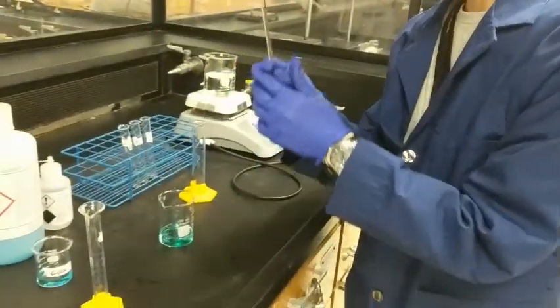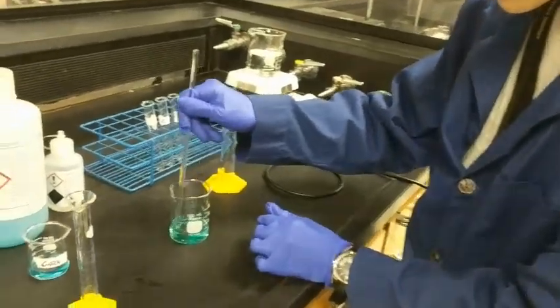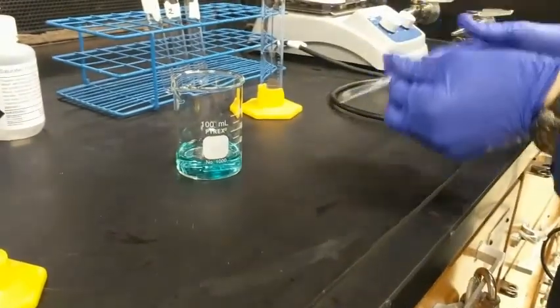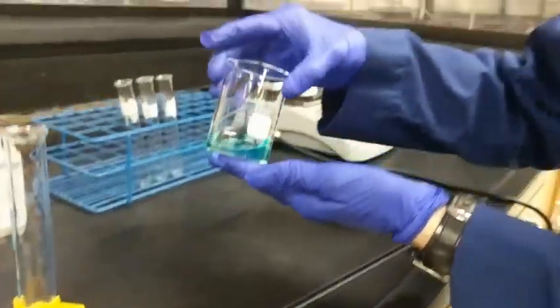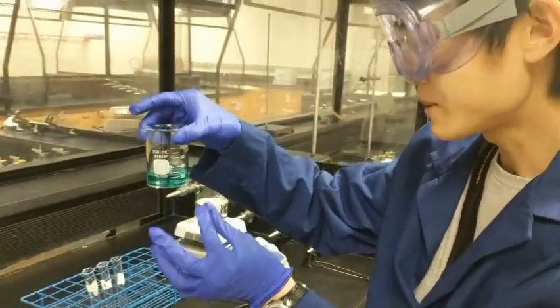Then, using a glass stirring rod, just gently mix it together. Alright. The final product is kind of bluish and a little bit greenish.